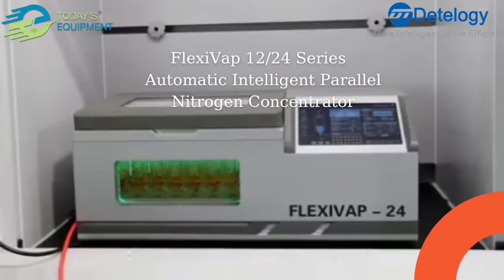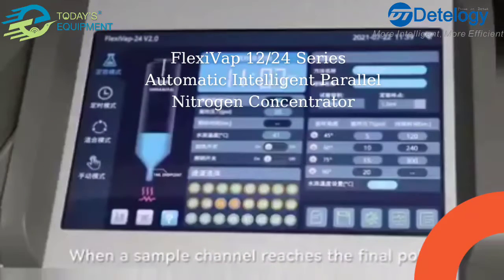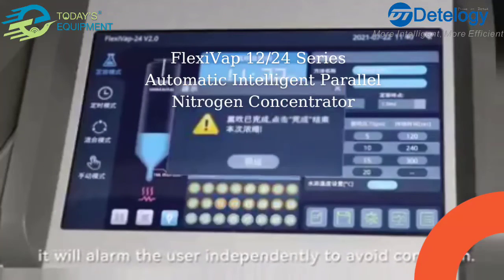Sensors of different samples are not shared, to avoid liquid level deviation. When a sample channel reaches the final endpoint, it will alarm the user independently to avoid confusion.